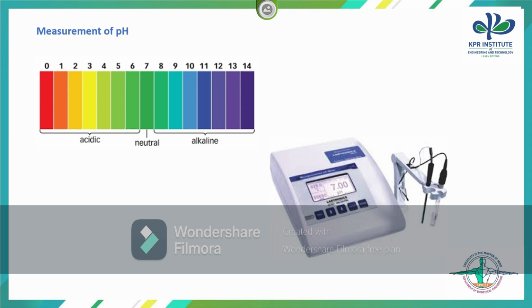Let's discuss measurement of pH. Measurements of pH and conductance are very important, as discussed. We have studied that the pH scale is a common convenient means of expressing the relative acidity or alkalinity of solutions. The pH of a system plays a very vital role in the success of many chemical and biochemical reactions. The pH of pure water is 7, therefore the pH of any water sample may give an indication of the type of impurity present in water. In this experiment, we will measure the pH of the given solution.